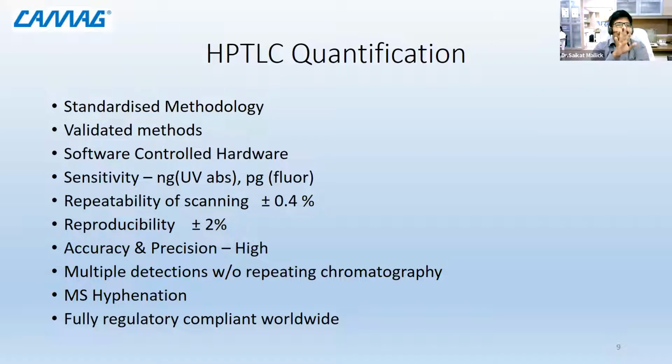So technically 10 raised to 4 we are going downstairs. So that is how you can see if a 1000 ppm solution is there, it can be easily analyzed, or if a 100 ppm solution is there, it can be easily analyzed. Even if the molecule is fluorescent, we can analyze at picogram level also.